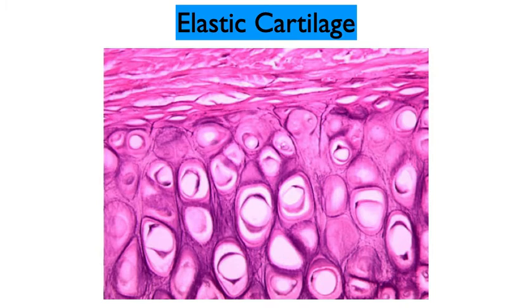We don't want them grinding against each other, so they offer a lubricated joint which they can relatively smoothly move past one another. Here, again, you see these little clefts, these lacunae, and the cartilage cells, the chondrocytes that are going to actually produce the cartilage, are found inside of those lacunae.